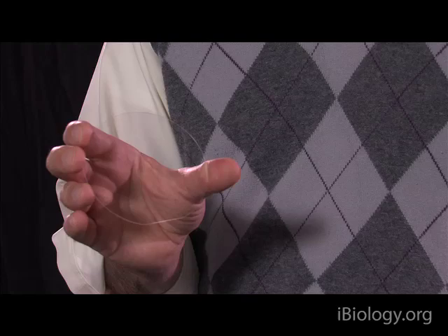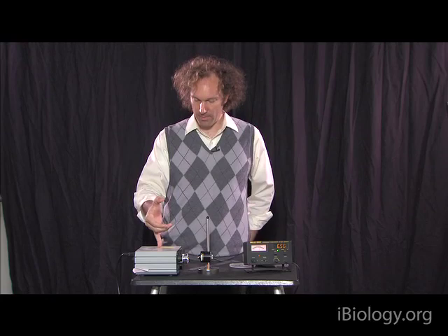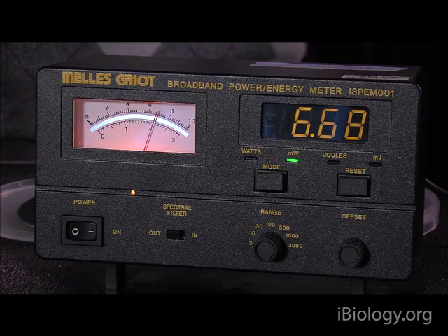It may even be hard to see, but there's a real piece of quartz right here. And what I've got are a light source, this is a halogen lamp, and a little detector. This thing right here is a detector that measures how much intensity is present on the face of this detector, and we can read it out with this dial here. If you see that little red thing moving back and forth, that tells us how much light is hitting the detector. Now, this is transparent, so it means, at least to our eye, light can pass through it.